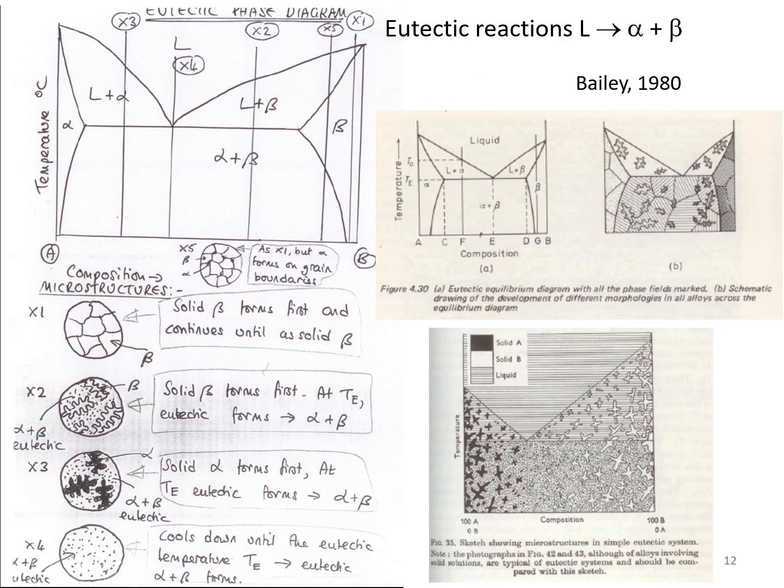And then next, eutectic, and eutectic means intimate mixture, I was always told, but somebody told me it meant something else. So eutectic is two things. And this is quite fun. It shows the eutectic diagram, and it also shows a little microstructure within the different phase fields within that.